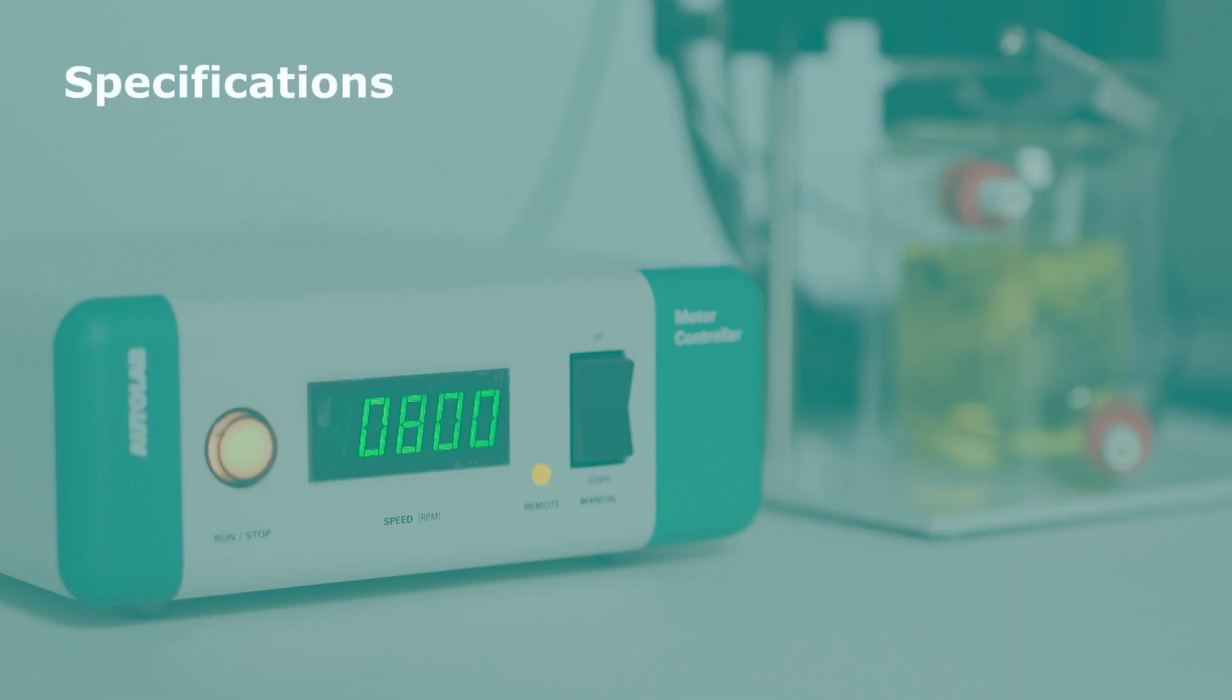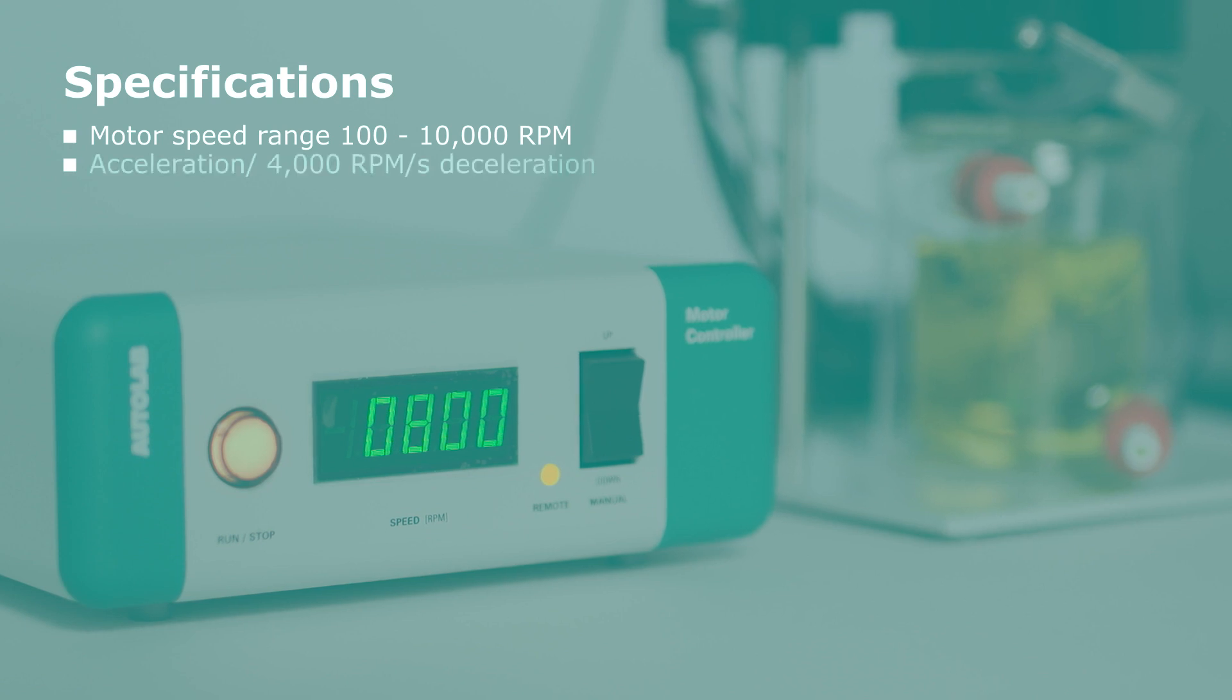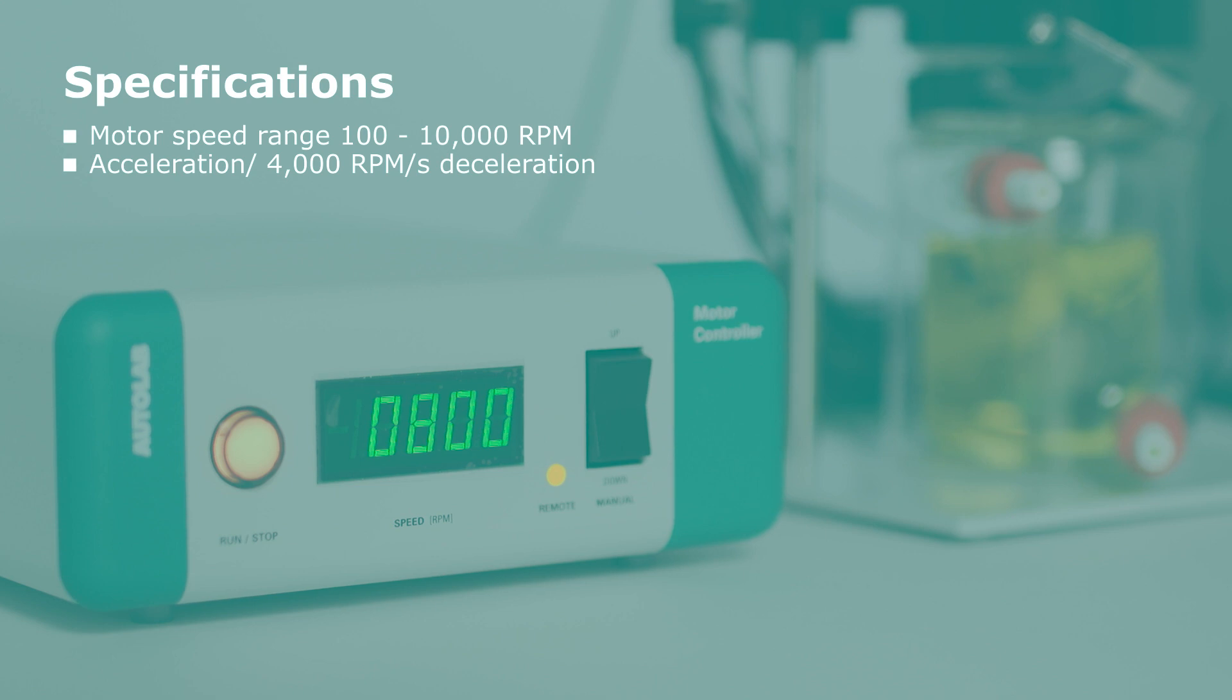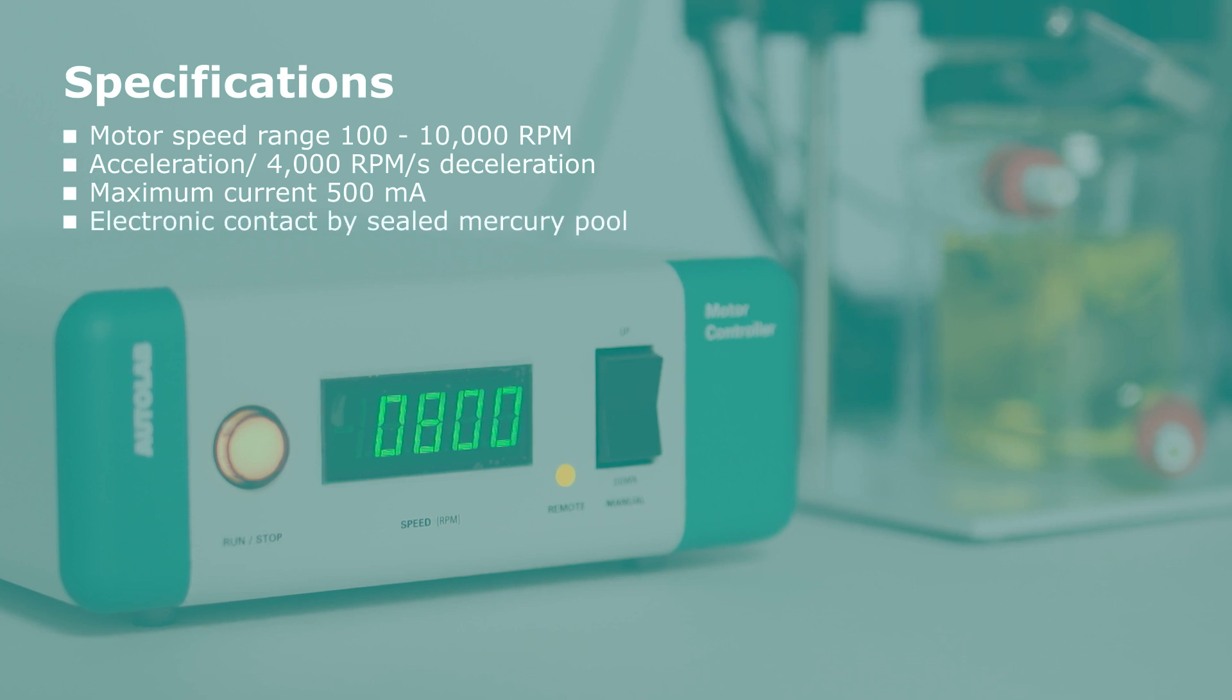The Metrohm Autolab rotating disk electrode with a low noise mercury contact facilitates a smooth current signal. The main specifications of the Metrohm rotating disk electrode are the motor speed range from 100 rpm to 10,000 rpm, the acceleration and deceleration is 4000 rpm per second, the maximum current goes up to 500 mA and the electronic contact is by sealed mercury pool.